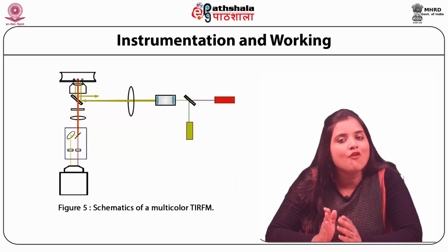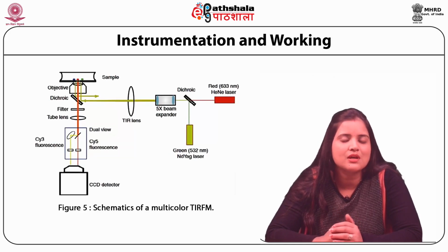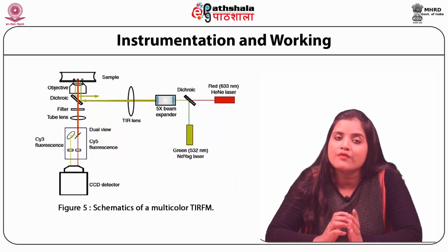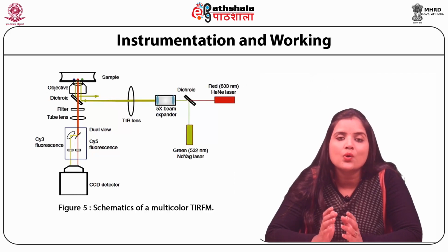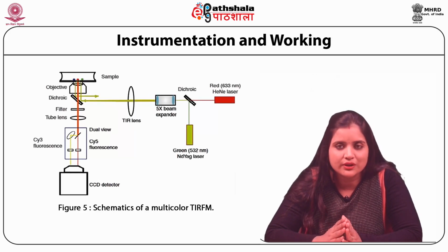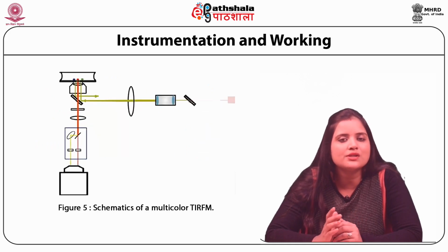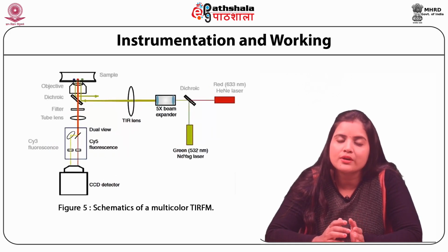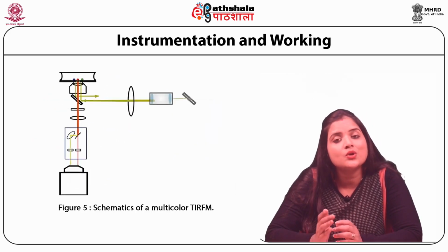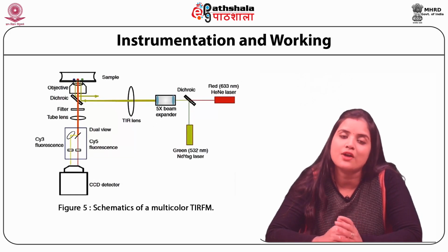Nearest neighbors of proteins, interaction states, as well as reaction mechanisms can be studied via fluorescence resonance energy transfer (FRET) and fluorescence correlation microscopic technique. In vivo, the dynamics of single tagged molecules or assemblies of molecules can be studied by employing the superior sensitivity technique, which is termed total internal reflection fluorescence, that is, the TIRF microscopic technique.